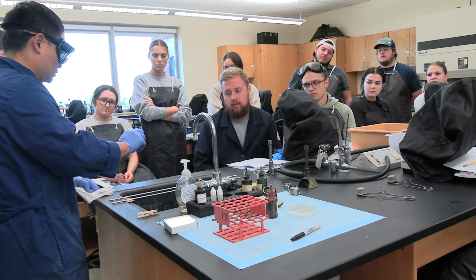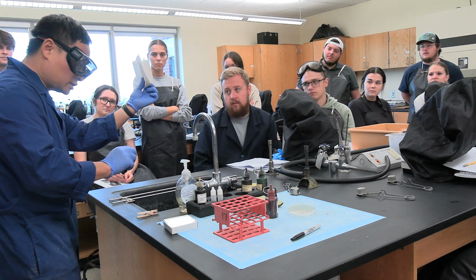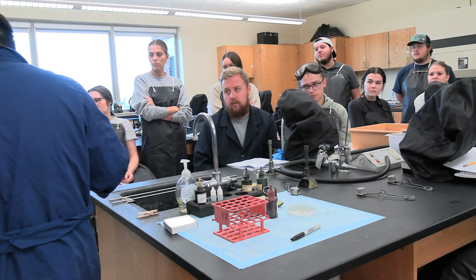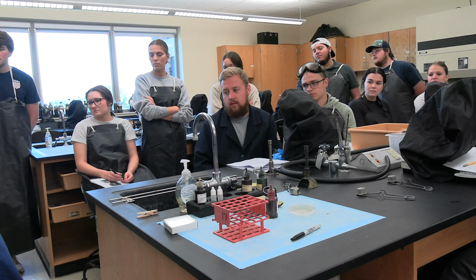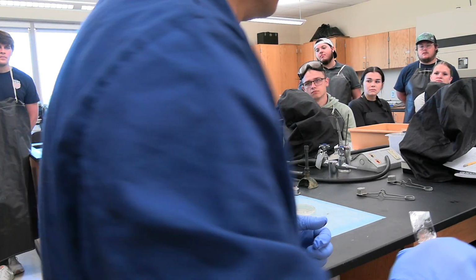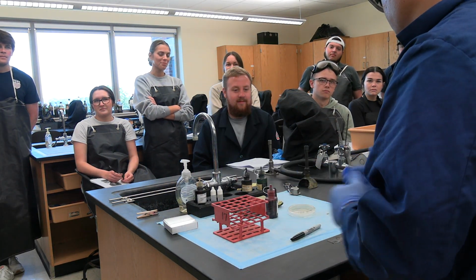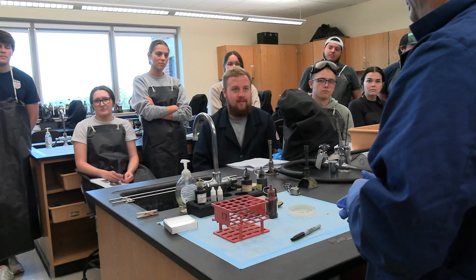This guy, because it's touched the dye, counts as biohazard trash. So make sure it goes right here, not in the general trash. Very important. Everybody should know all these dyes count as biochemical hazard.